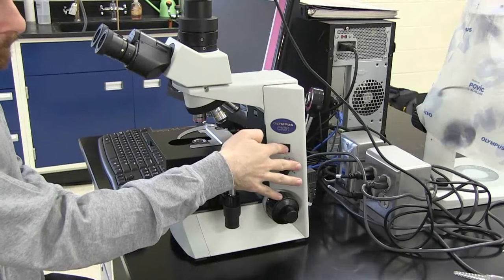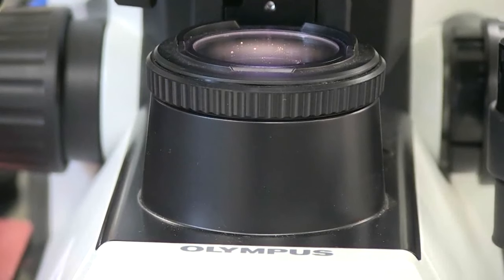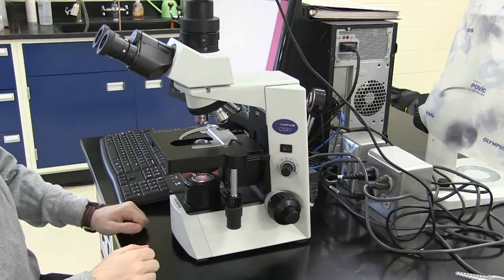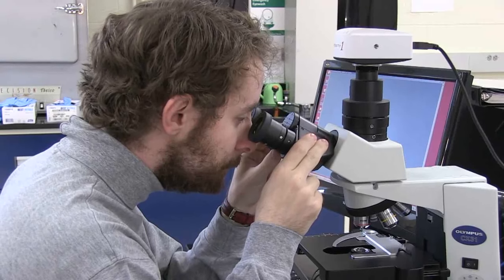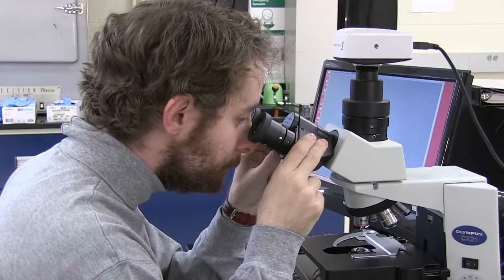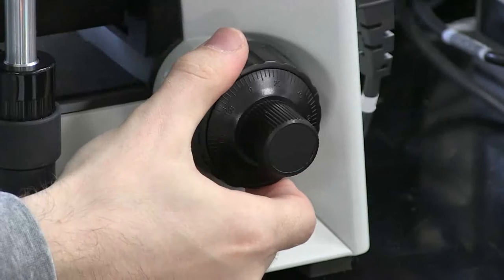Begin by turning on the microscope. Adjust the ocular eyepieces to match your interpupillary distance, such that when looking through the microscope with both eyes, you should see one image.